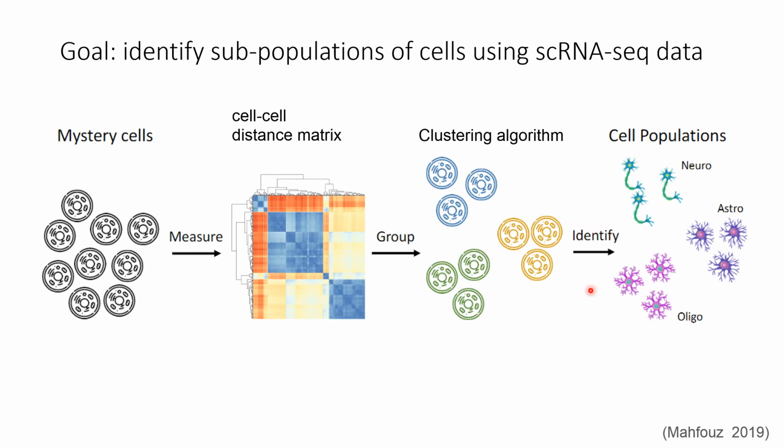So despite this, the core assumption of current cell type clustering approaches for single-cell RNA-seq analysis is that there exist well-separable regions in gene expression space, or geometries, that map to discrete cell identities, or at least this is the best that we currently know how to do, and we hope that we will learn informative and interesting things. So the standard single-cell RNA-seq analysis procedure recommends combining prior biological knowledge of marker genes with clustering algorithms to try and partition mystery cells into identified cell populations based on their similarities in gene expression.